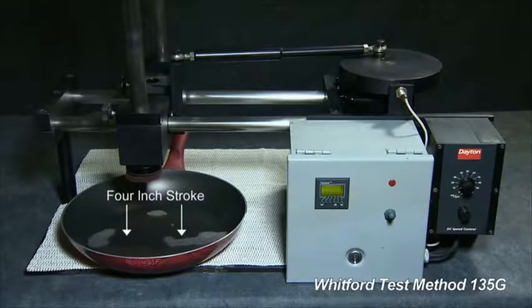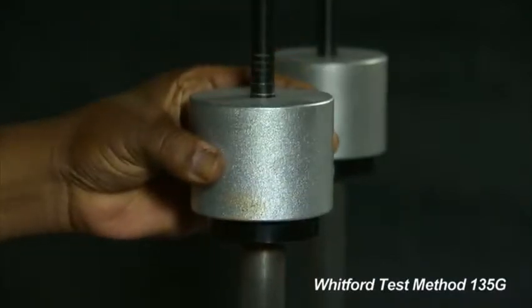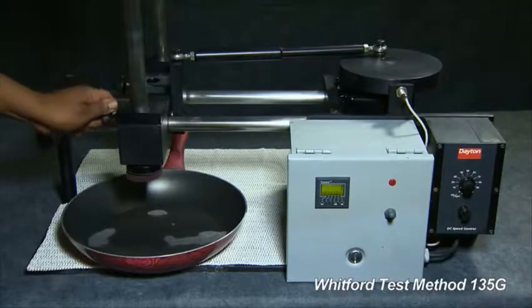Set the length of the stroke to 4 inches. Whitford uses a 3 kilo weight to shorten the time of the test. Lower the stylus onto the pan.